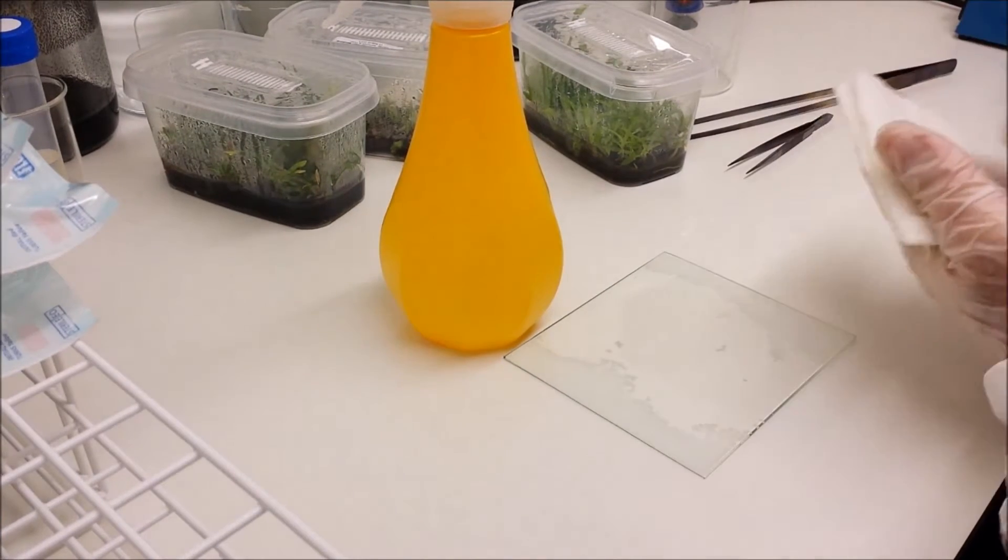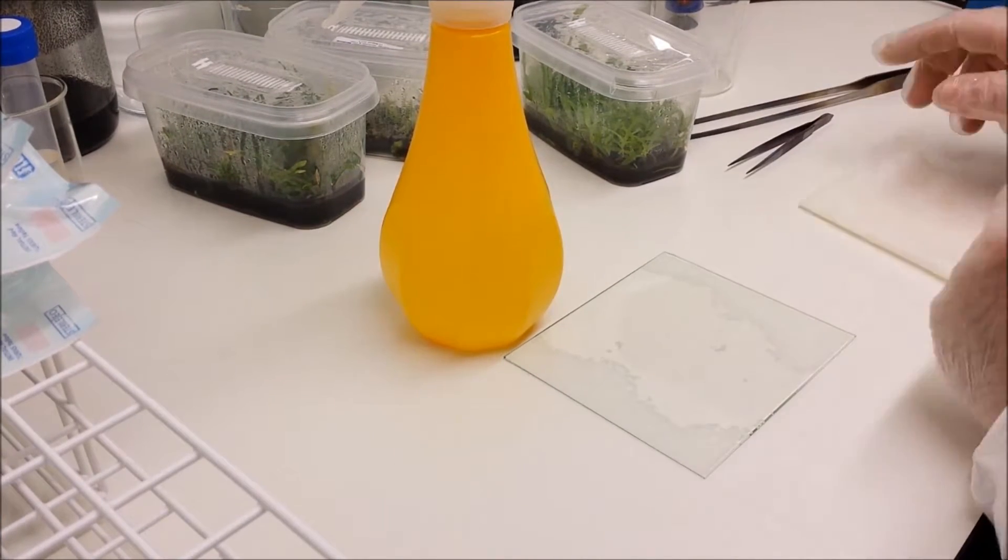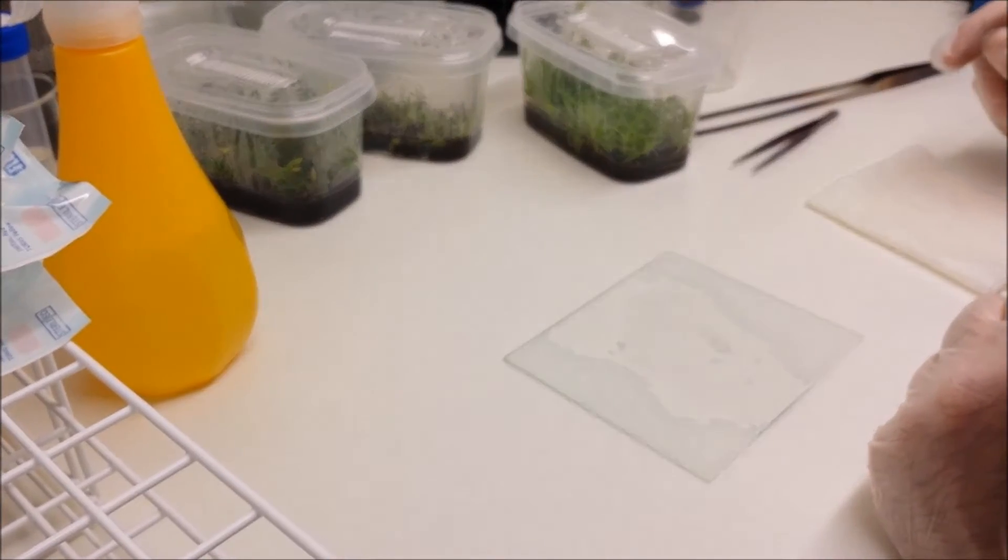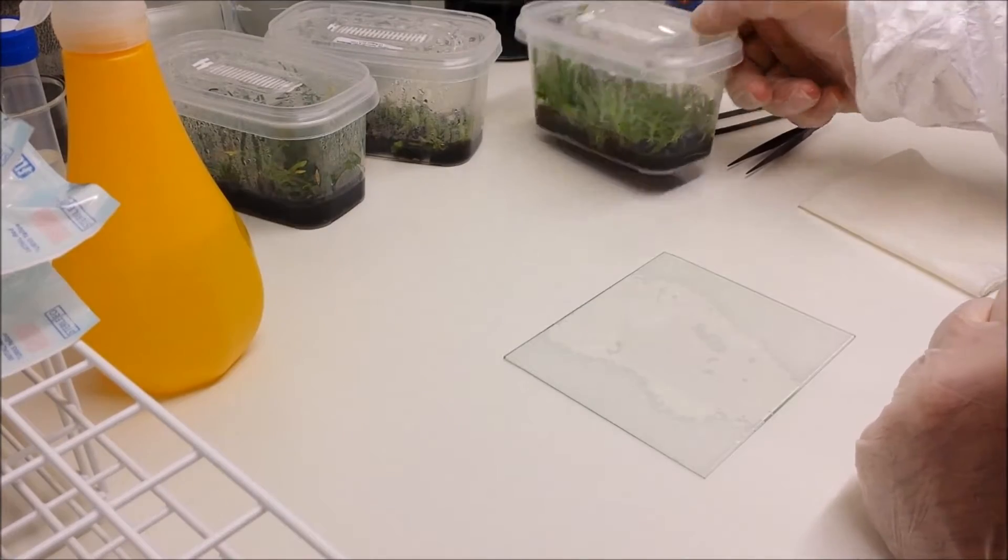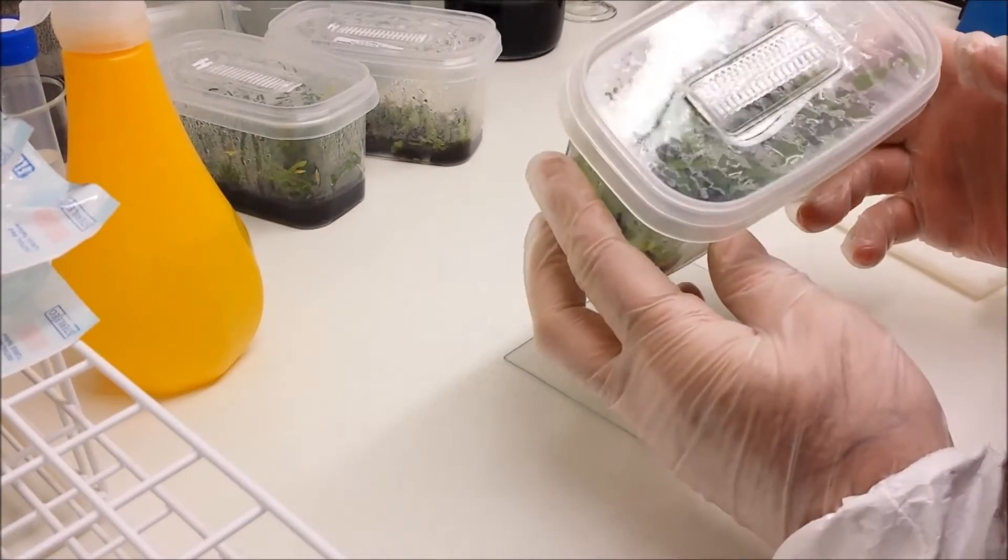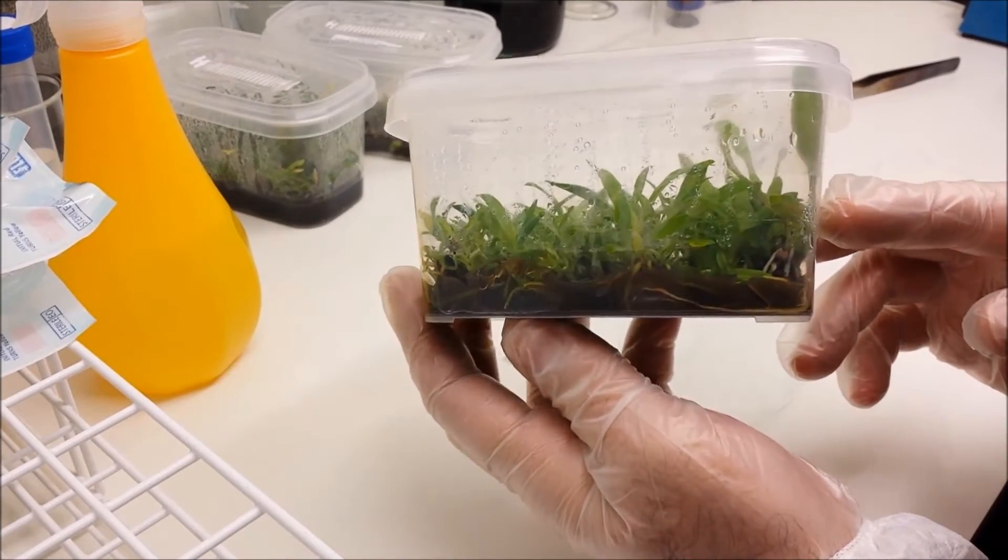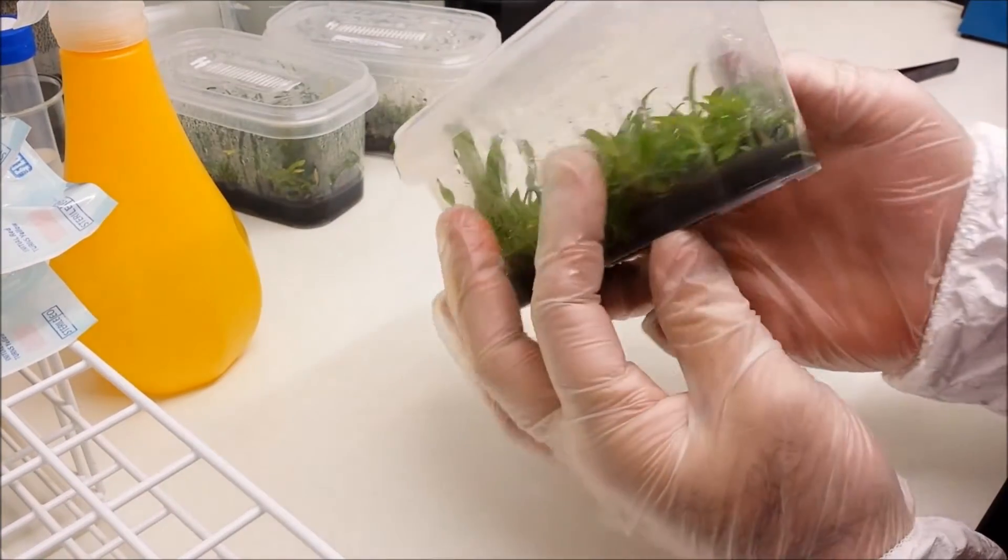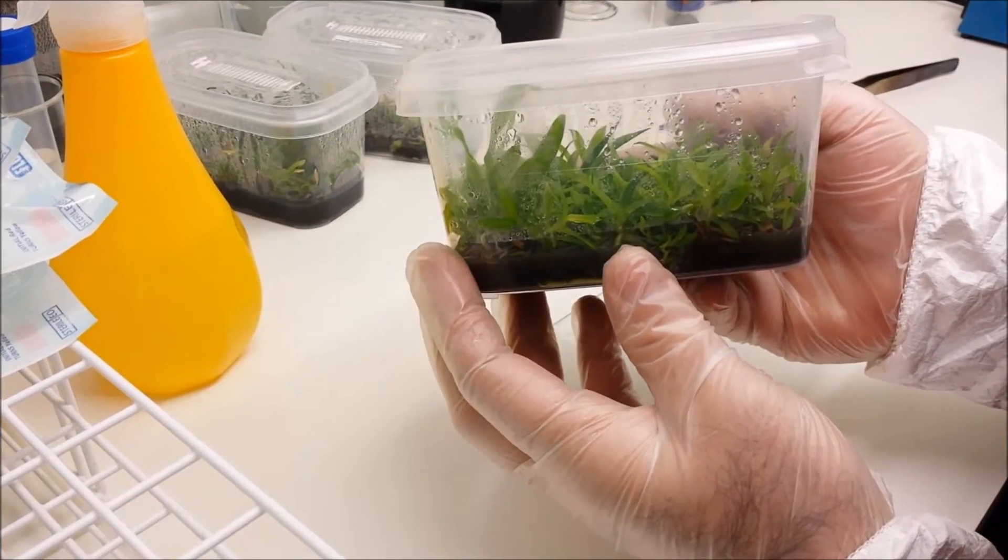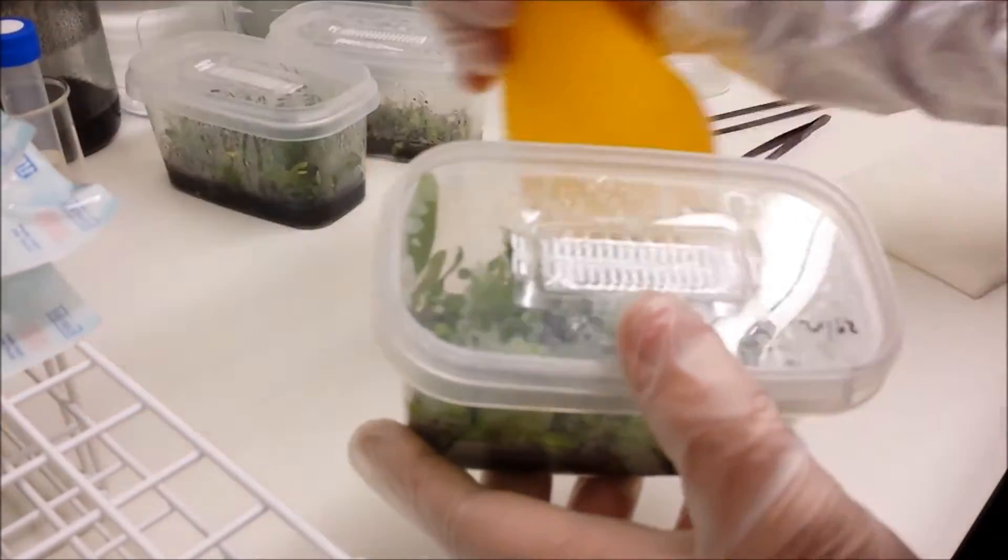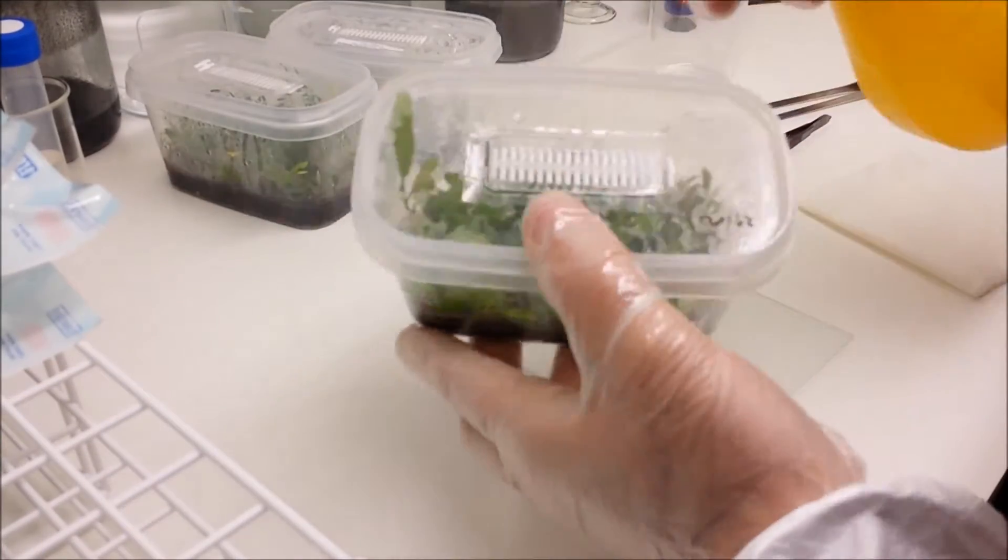And today what we're going to be using, we're going to be deflasking and replating some Cattleya genmanii, which is a lovely five inch flowered plant from Guyana and Venezuela. As you can see these are lovely healthy seedlings. They're around about an inch, inch and a half tall. And this is what we call a mother flask. And in this flask will be probably something like a hundred plants.